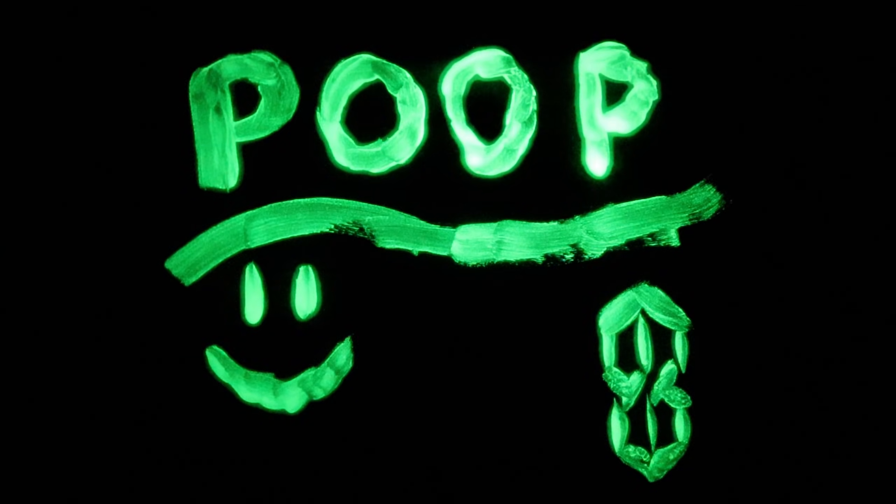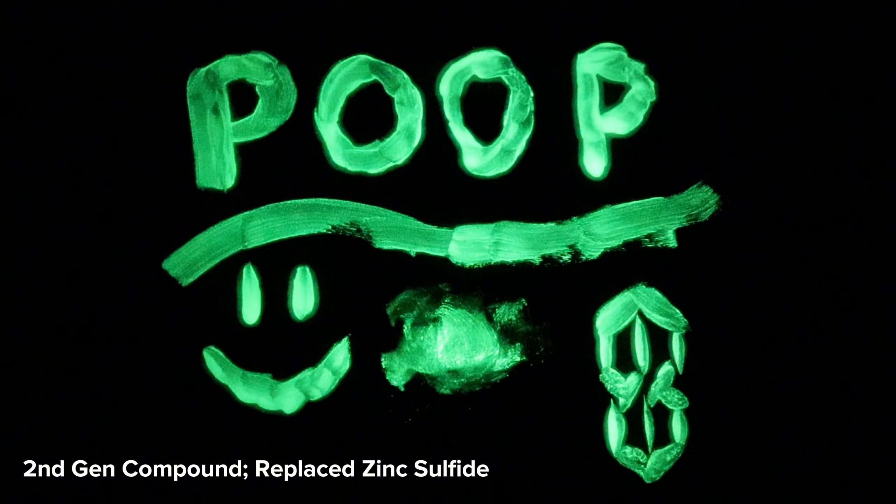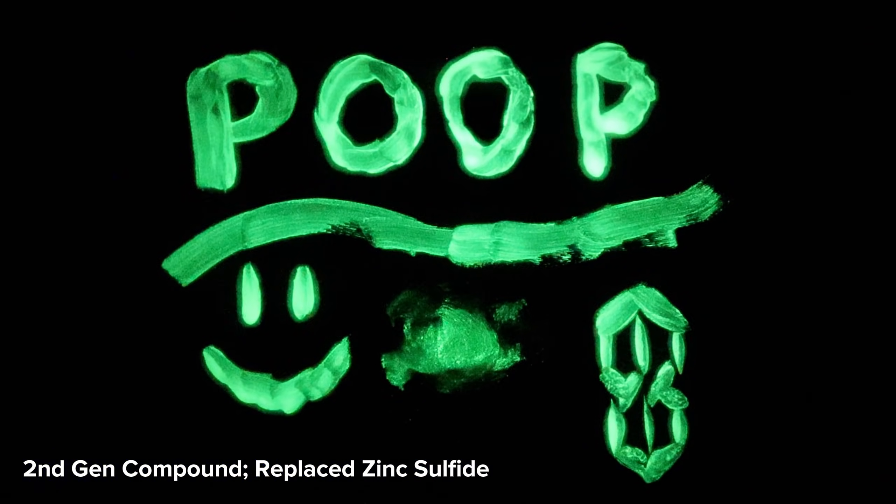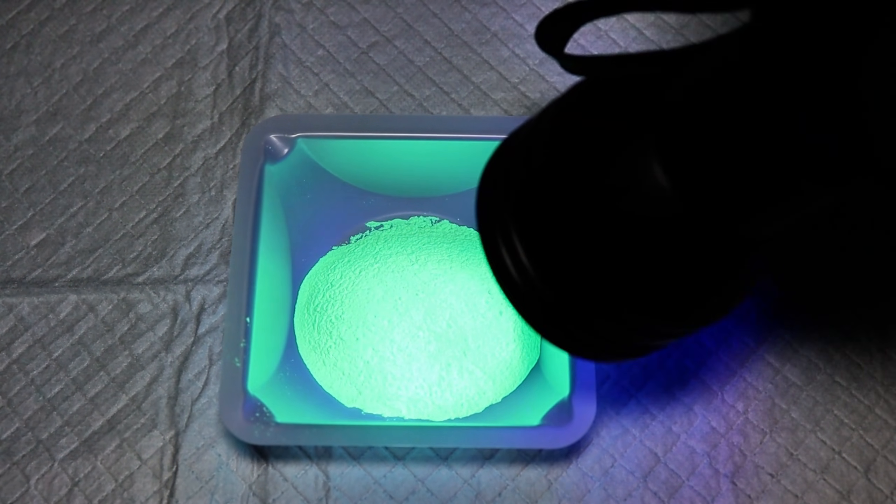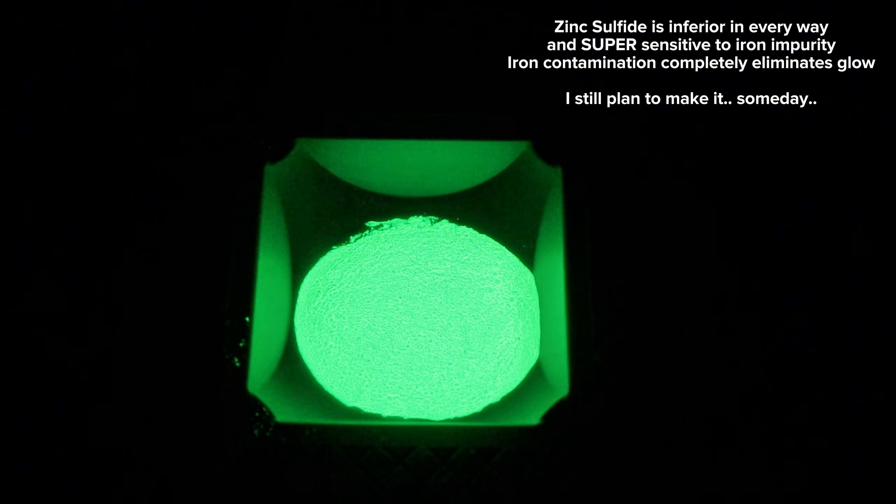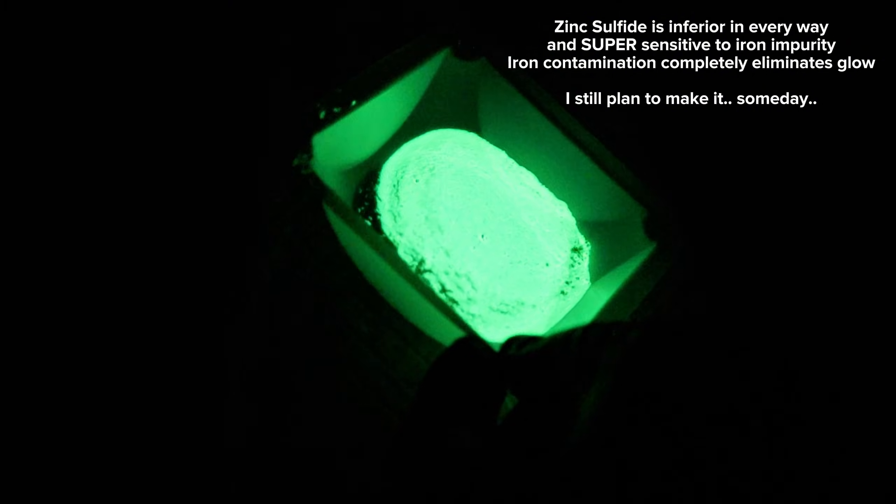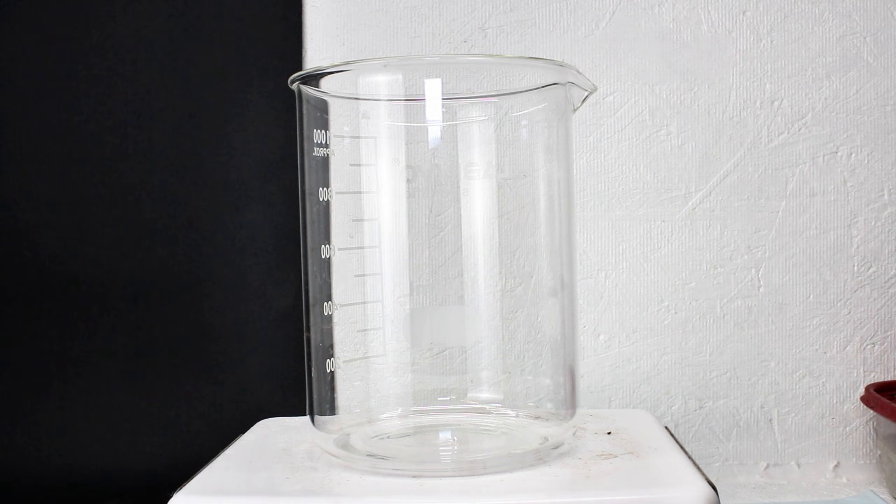Strontium aluminate is a second generation luminous compound and replaced the first generation zinc sulfide. Zinc sulfide doesn't glow nearly as long or intensely and it tends to wear out a lot faster than strontium aluminate. I've actually tried to make zinc sulfide a couple times as well, but the chemical is incredibly sensitive to iron impurities, which is a really tough thing for me to eliminate entirely in my lab.